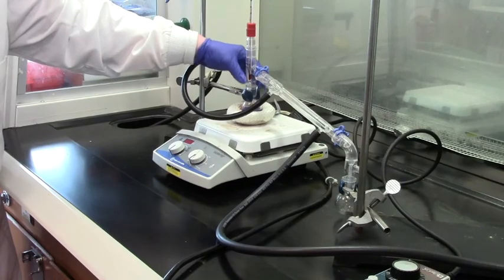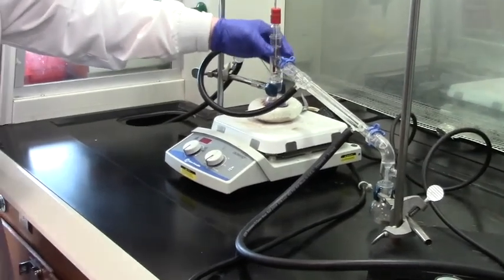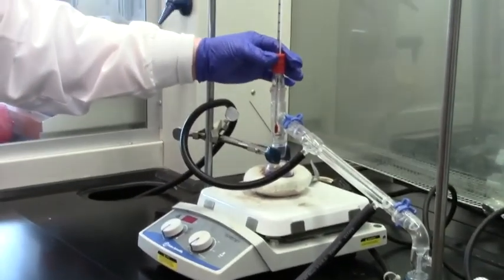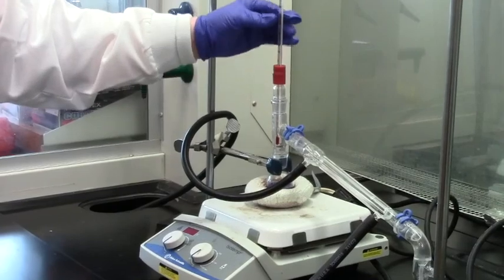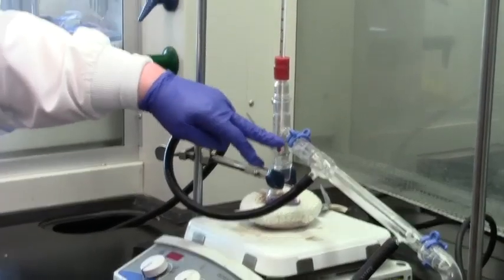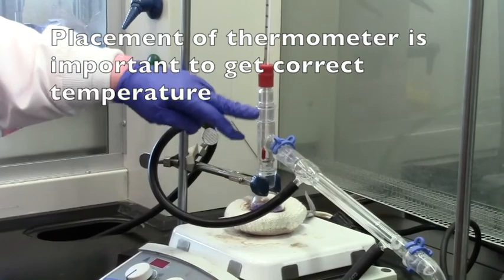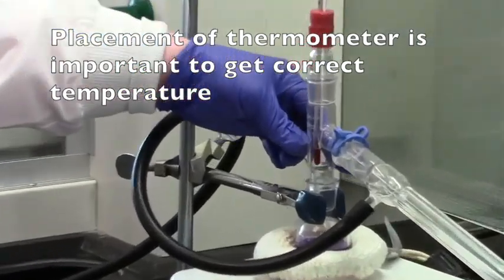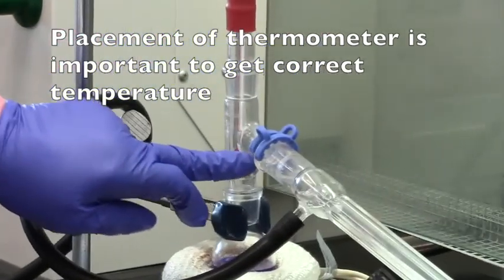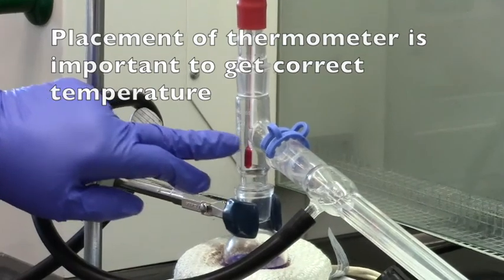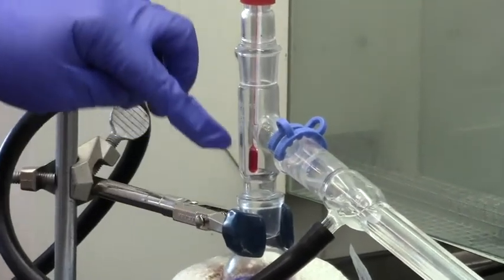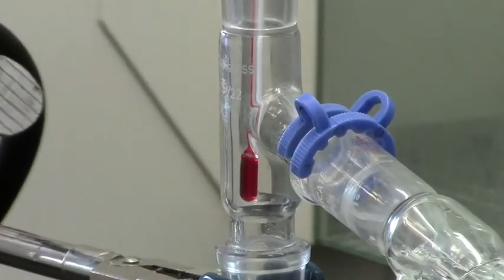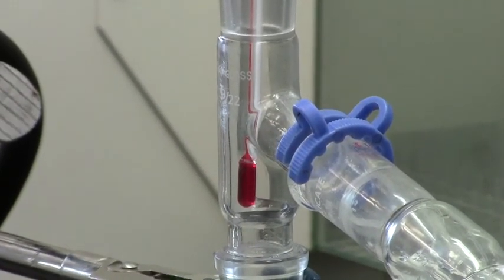This distilling flask is connected to what we call the sidearm, and above that, we have the thermometer adapter, and the thermometer adapter obviously holds a thermometer. It's important that you place the thermometer at the correct position. We like the top of this thermometer to be flush with the sidearm here that you see. If you have it lower than that or higher than that, then when you measure the temperature at which the first drop distills over will probably be incorrect.